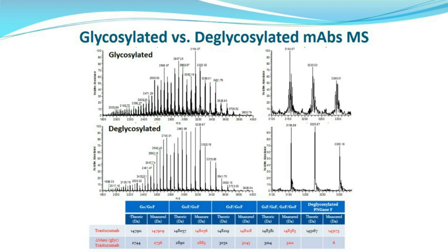So this really underlies why we need better mobile phase conditions and chromatographic materials so that we can chromatographically resolve those variant materials and feel greater confidence in our deconvoluted mass spectral data.